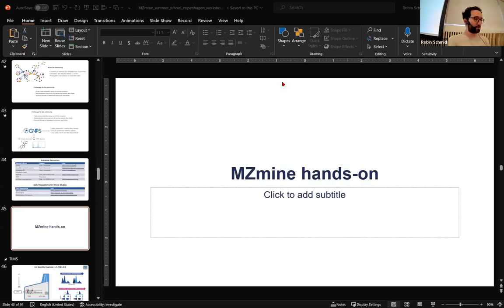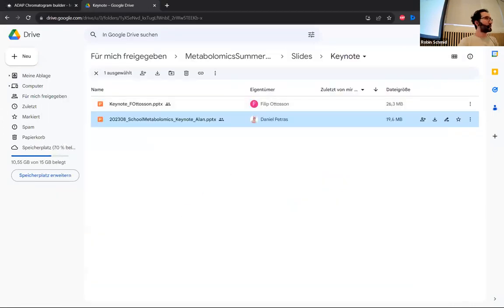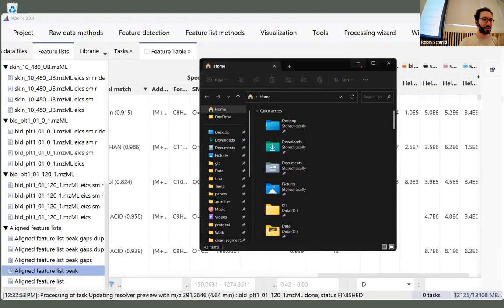Share. I hope everyone also remotely still sees the screen.